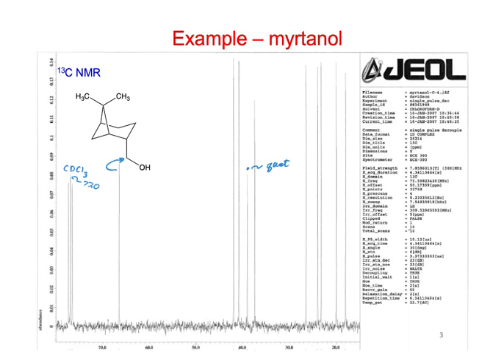Remember in the C13, and I don't know if this is true here, both of these probably have some steric constraints, right? When atoms get pushed close together, sometimes that pushes some of the electron density back onto the carbon, and it can cause it to be more shielded.